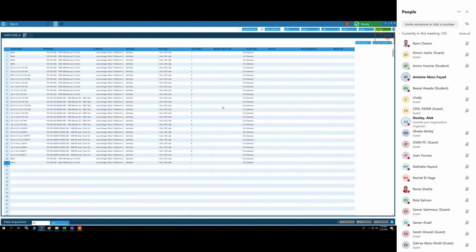Anyway, it will give you an error message and tell you that, so it will be easy to understand. But just as a warning, don't submit positive and negative samples in the same submission. They can be in the same batch and they can definitely be in the same queue.